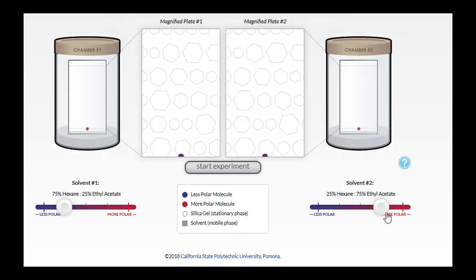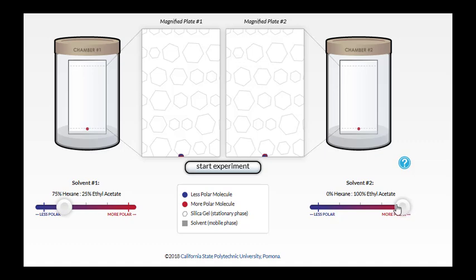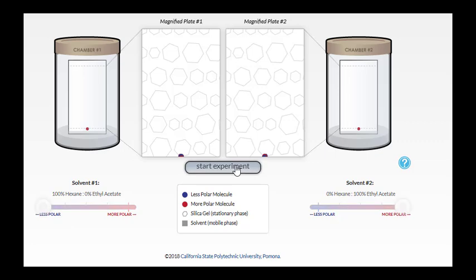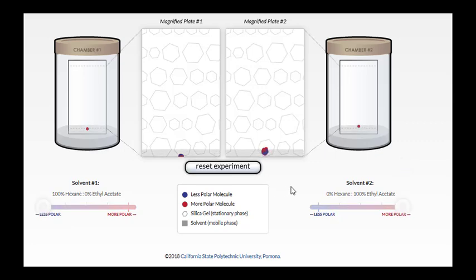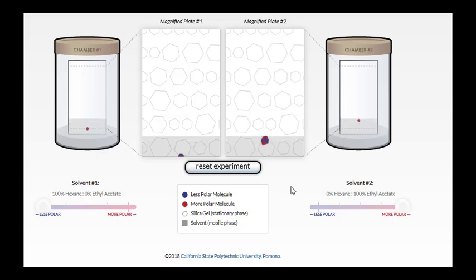Let's look at an extreme situation. What if we tried 100% ethyl acetate in our second chamber, a super polar solvent, and 100% hexane, a totally nonpolar solvent, in the TLC chamber on the left? Okay, now again, both of our molecules, the red and blue, are both polar molecules. They're just varying in how polar they are. And let's watch what happens.